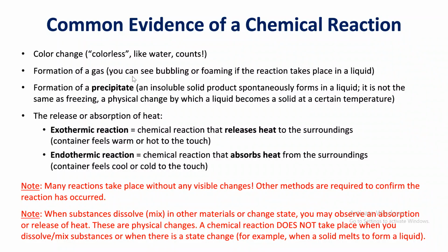Formation of a precipitate, that's what we're going to focus on today. That's the goal of today's experiment. A precipitate is an insoluble solid. Insoluble means this solid is not going to dissolve in water. When you have an insoluble solid forming in a liquid, it is a chemical reaction.